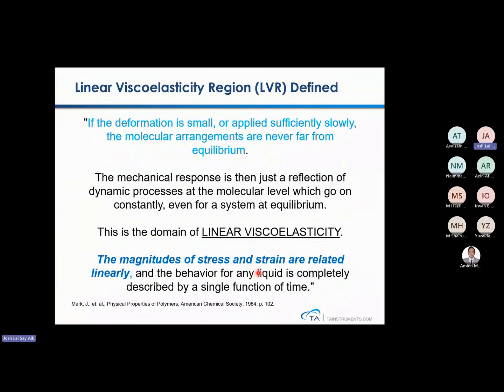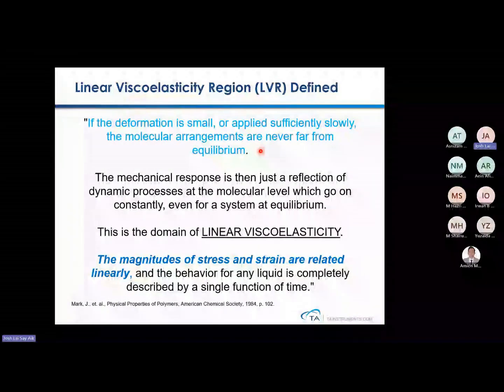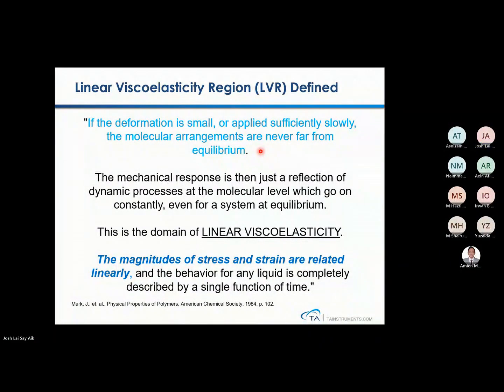So, LVR region, this is a very important subject. What do I mean by LVR? LVR means the deformation in the rheometer is very small, and the molecular arrangement is never far from equilibrium. In short, we are actually probing the molecular motion with a rheometer.